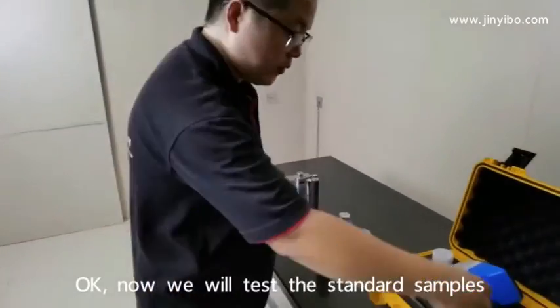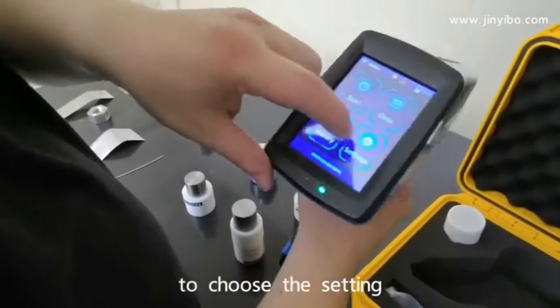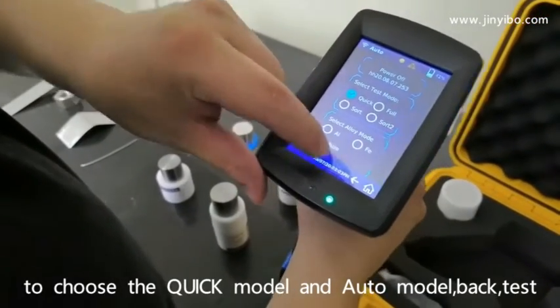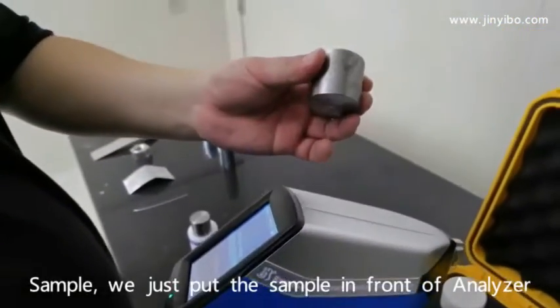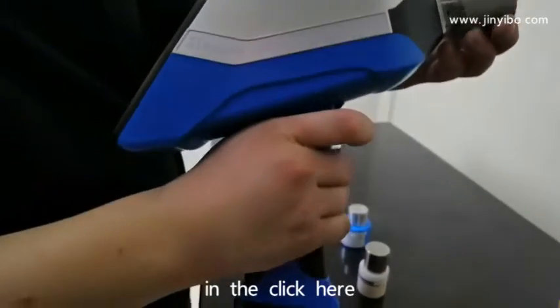Now we will test the samples. Choose the setting, click model, auto model, back, test. We just put the sample in front and click here.